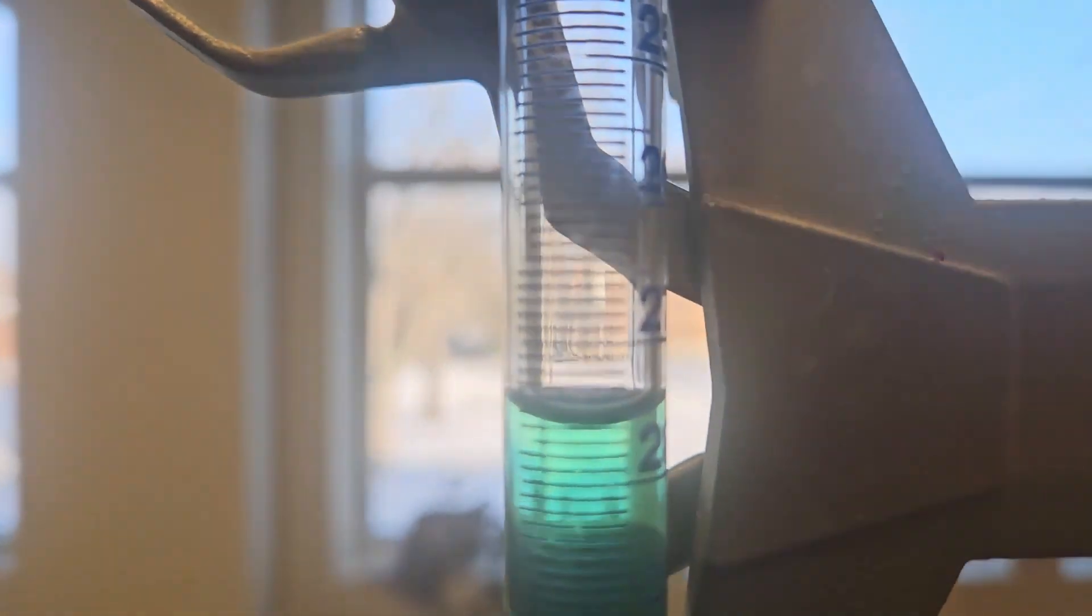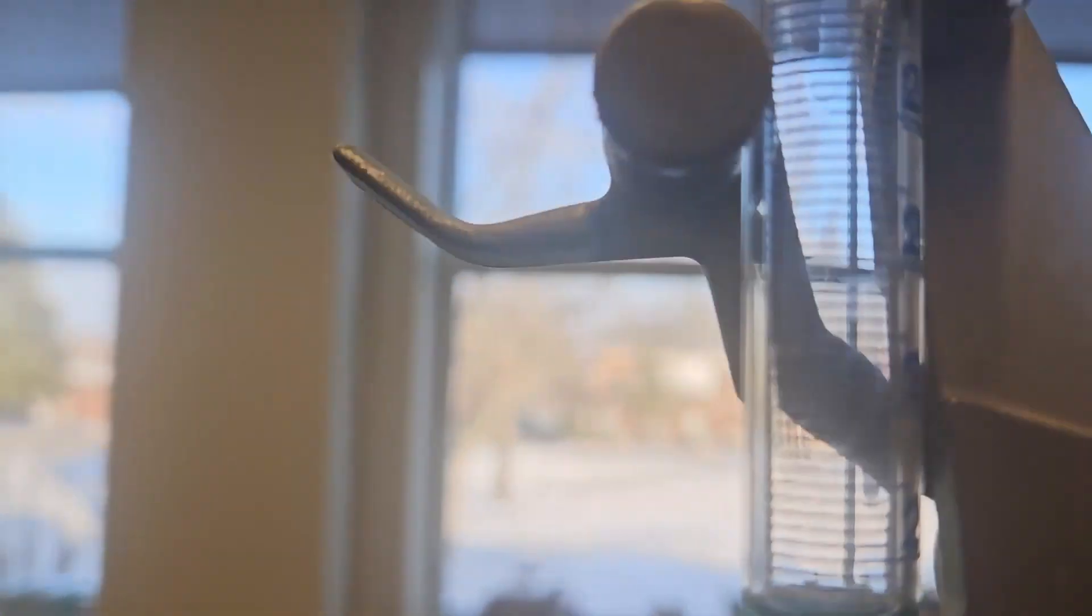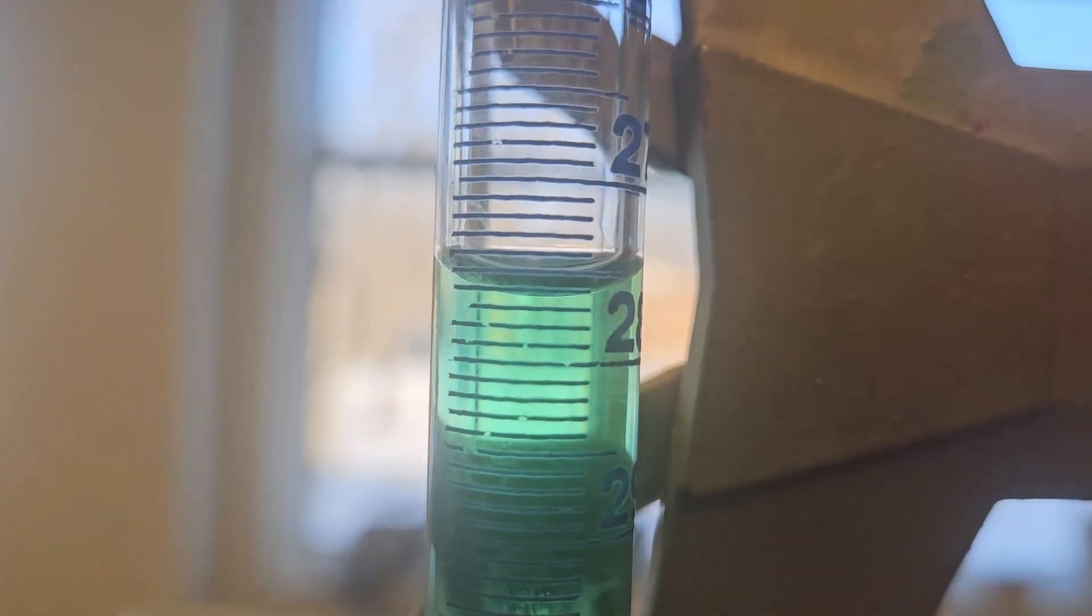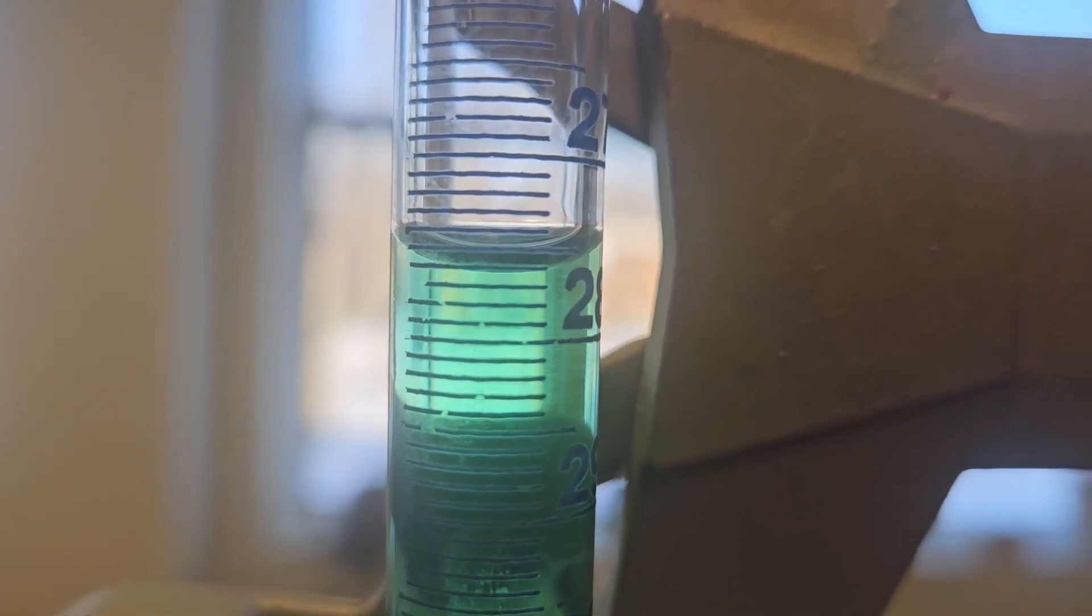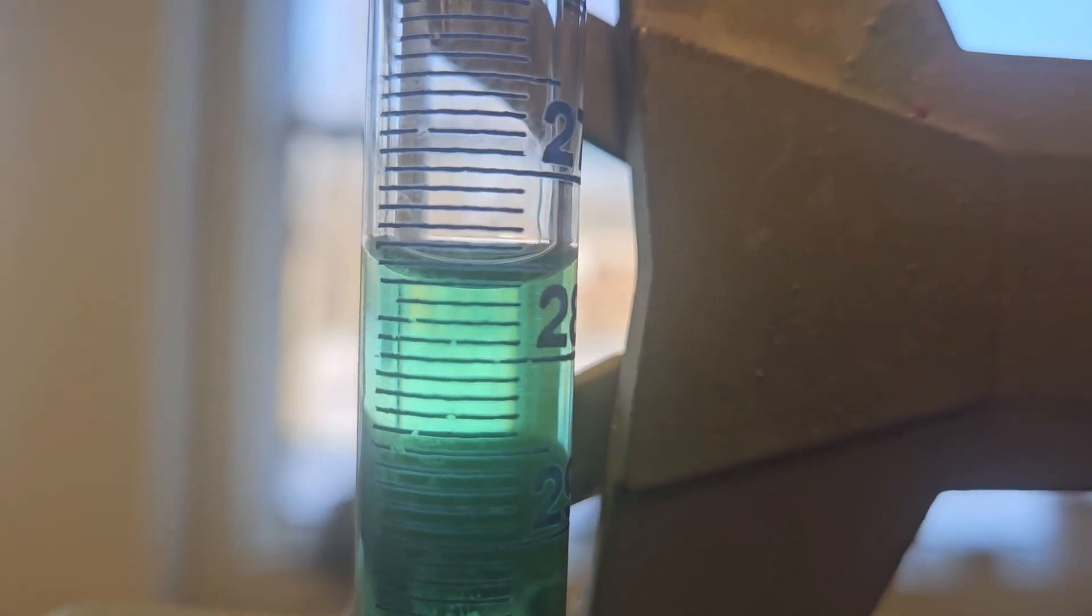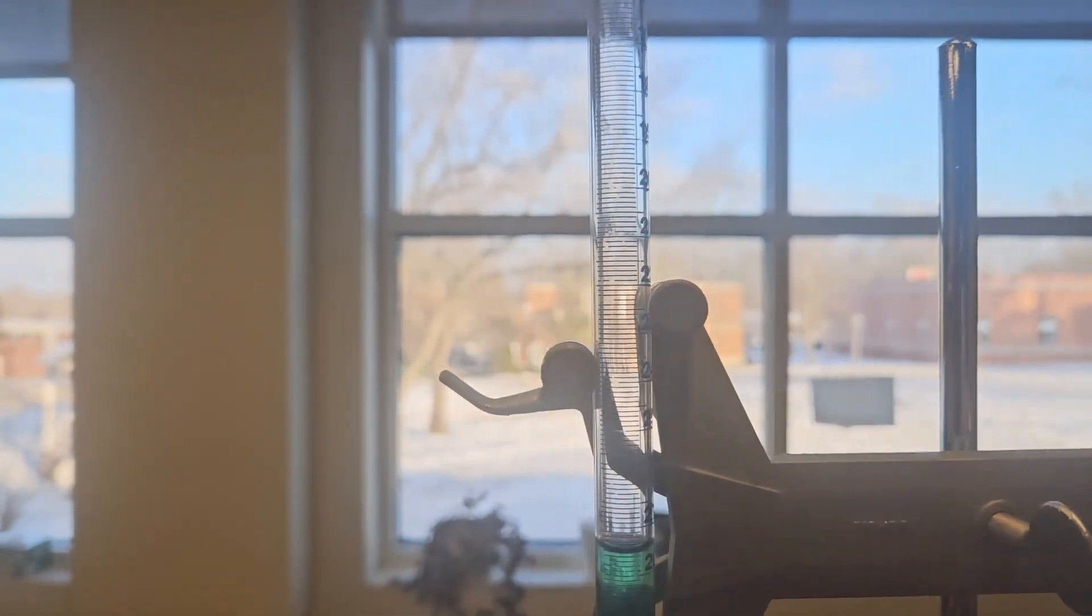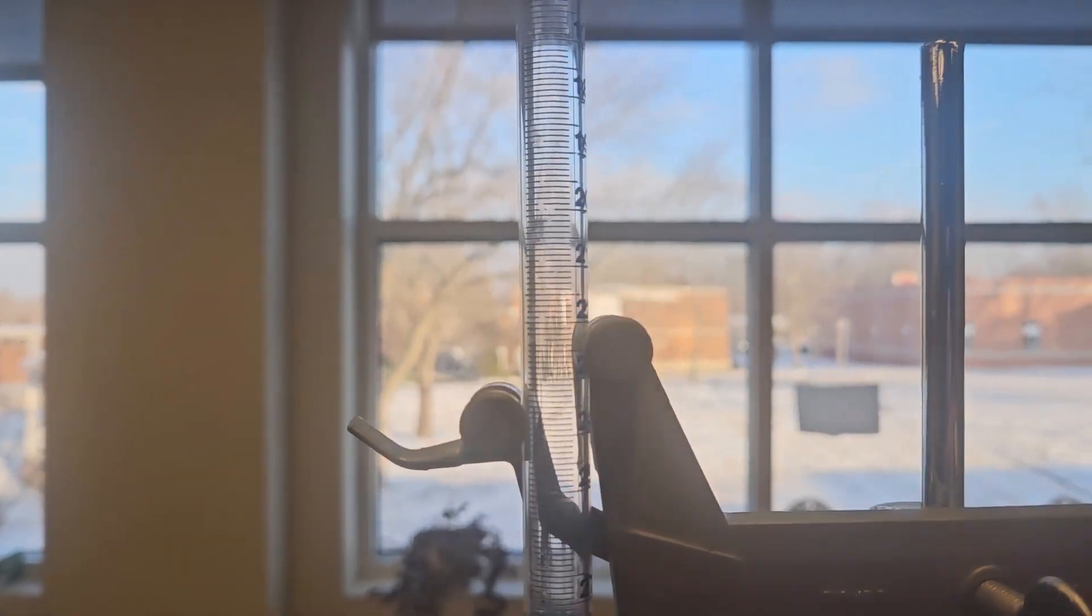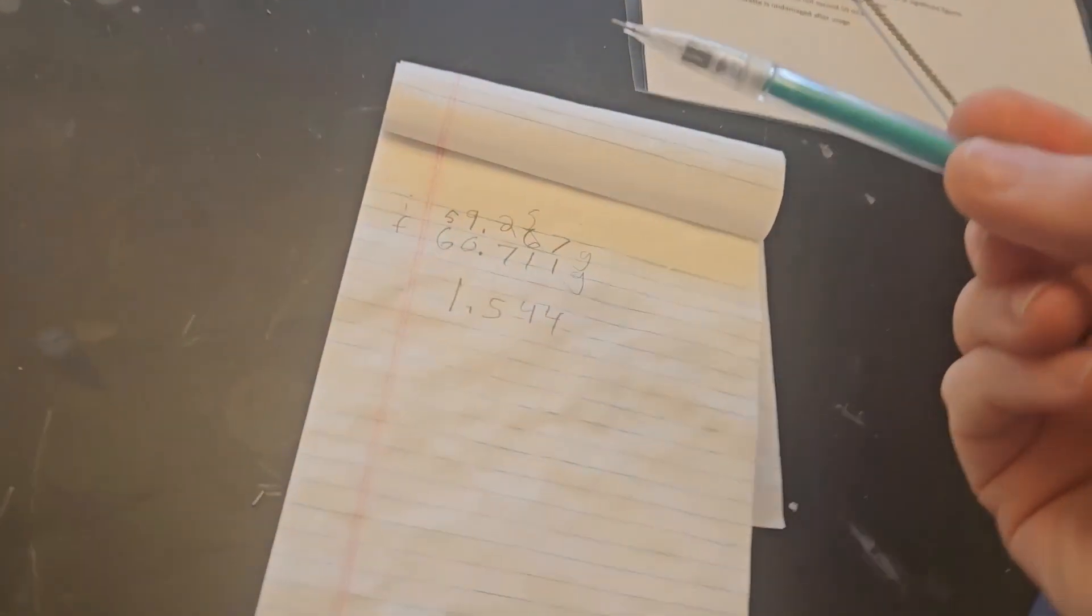The volume is not 28 mils and some change, it is 27 and some change. So looking at this very carefully, we're looking at the bottom of the meniscus. So reading there, that's 28, so 27.9, 27.8, 27.6, about 27.5, a little higher than 27.5, so it's somewhere between 27.5 and 27.4.